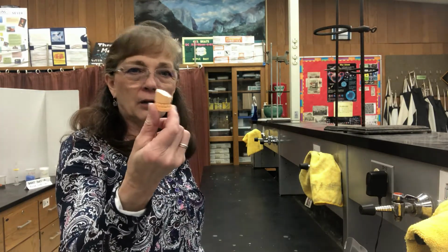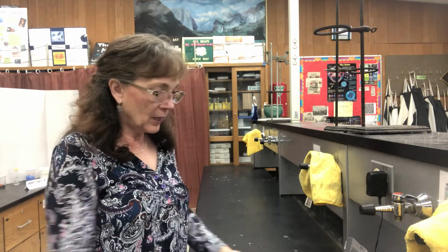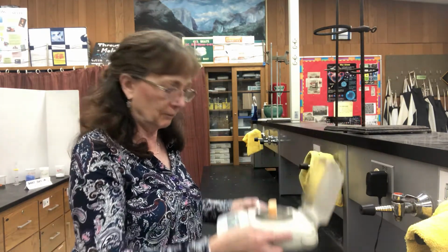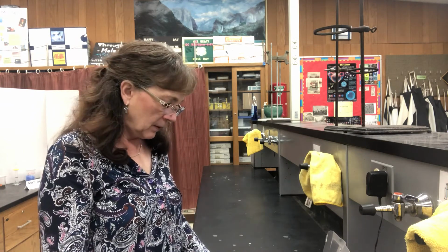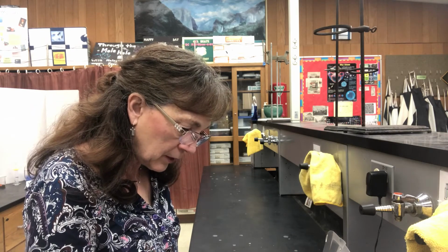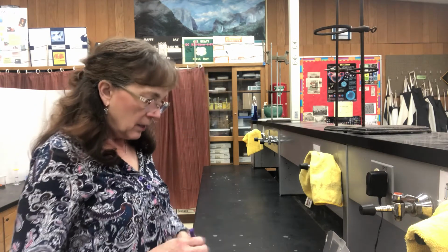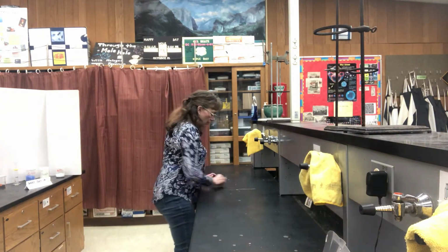This is a piece of chalk. Sidewalk chalk. I'm going to put it on the balance that you can't see, and get my starting mass. I'm going to record that mass, 7.33 grams, and then I'm going to go crazy and write my name on the counter.